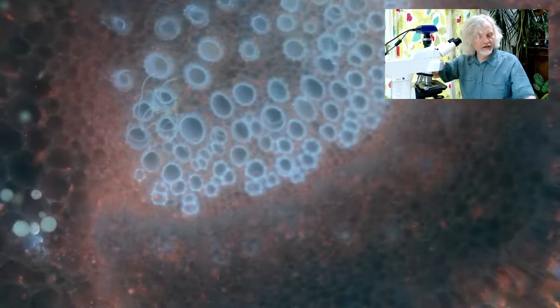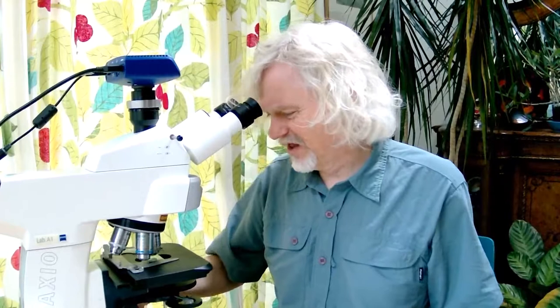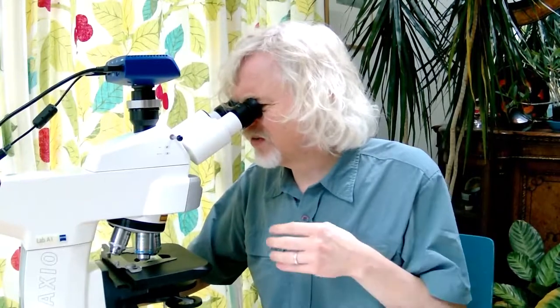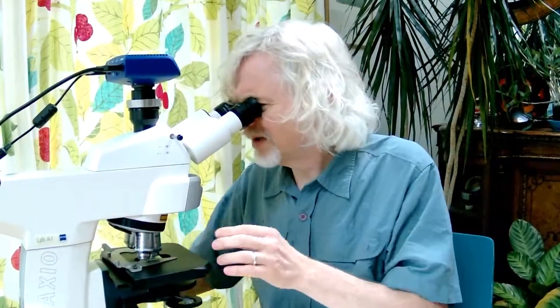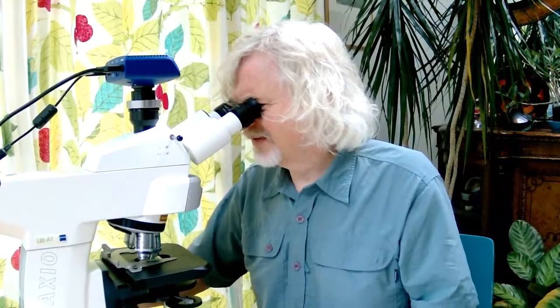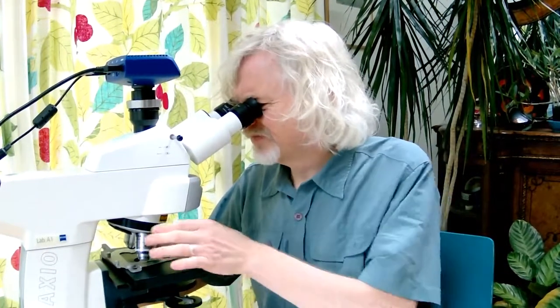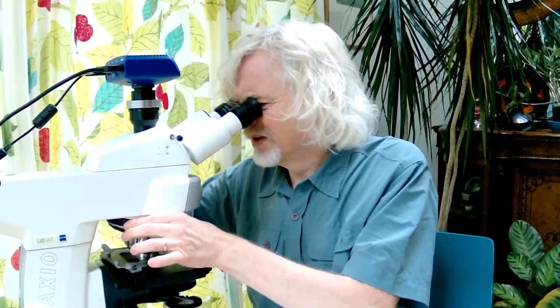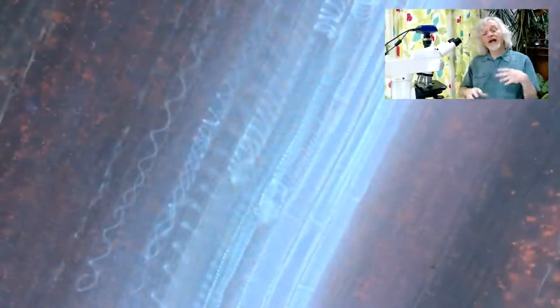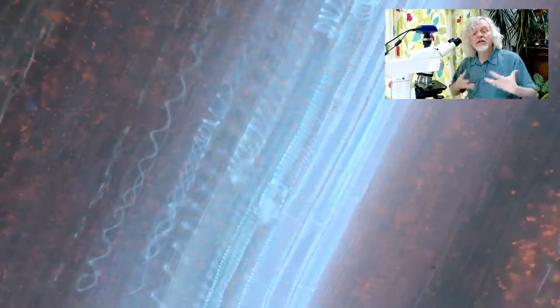And the last thing I want to show you, I'm going to have to find it. So I'm just going to zoom to this. I'm going to go to the section where I, remember, I cut a piece that way, as well as a piece that way. And if I go over to this section, where are you? There you are. And hopefully we've got a good bit. It's quite good. And I'm going to zoom in on this. And then focus. Turn the brightness up. Actually, I think I will stay out. Right, let me show you this.